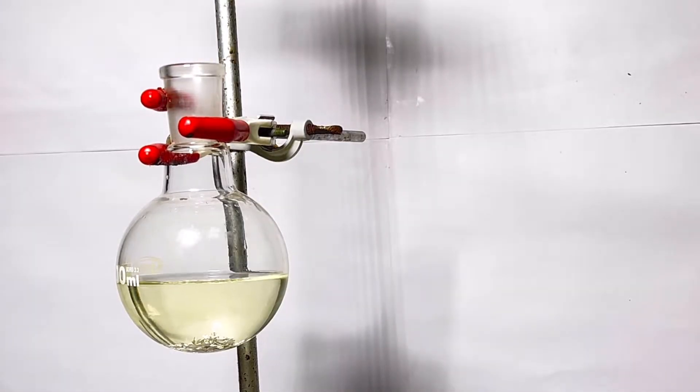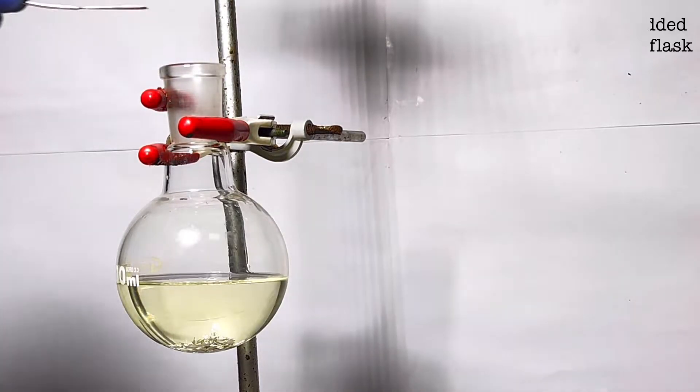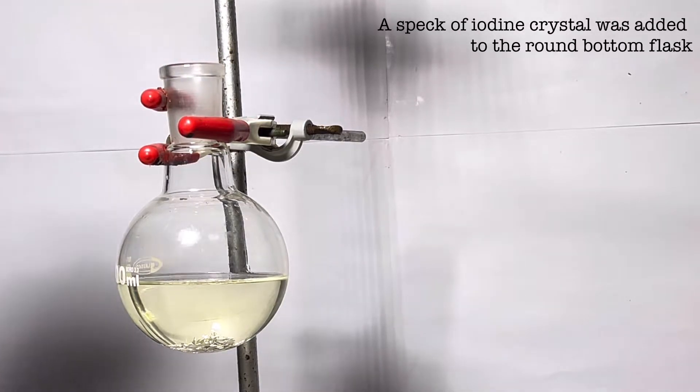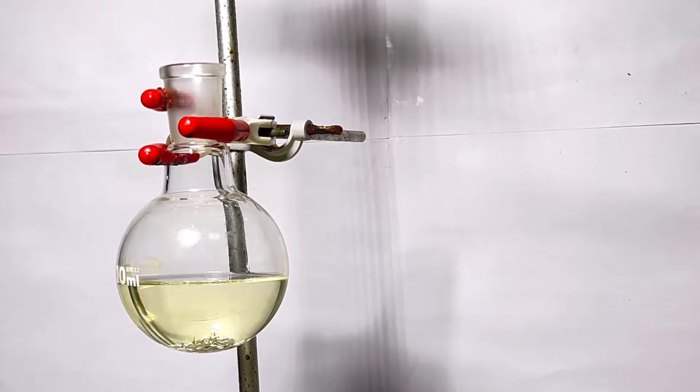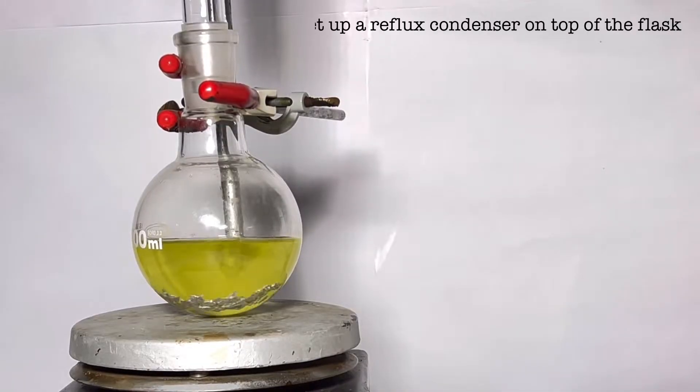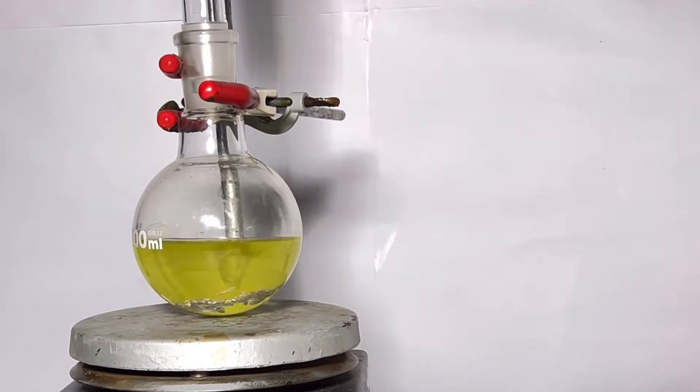The remaining 3 grams will be added later. Now, a speck of iodine crystal was added to the round bottom flask. Addition of iodine helps to remove any magnesium oxide present on the surface of magnesium metal turnings, thereby initiating the reaction. A magnetic stirring bar was then added to the round bottom flask, and the flask was set up on top of a hot plate stirrer equipped with a dimroth condenser.